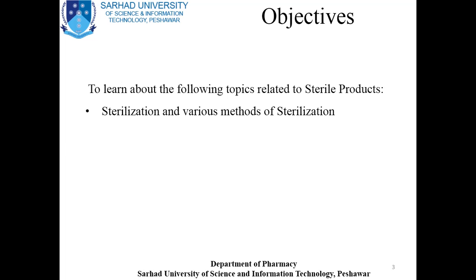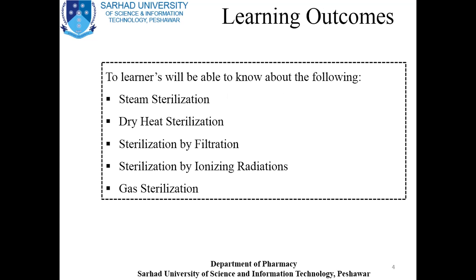We will discuss what is sterilization and what are the various methods of sterilization.